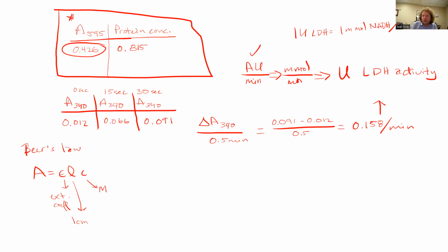So we have bridged the gap from millimole per minute to units of LDH activity. What we don't have is the direct connection from absorbance units to millimole.